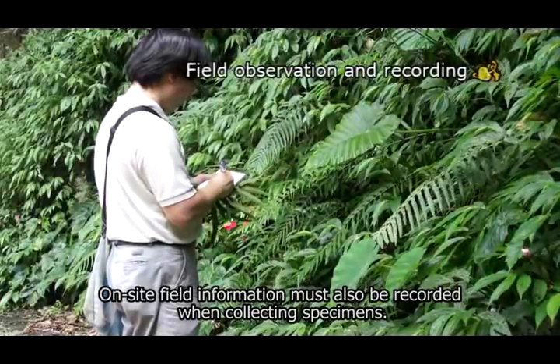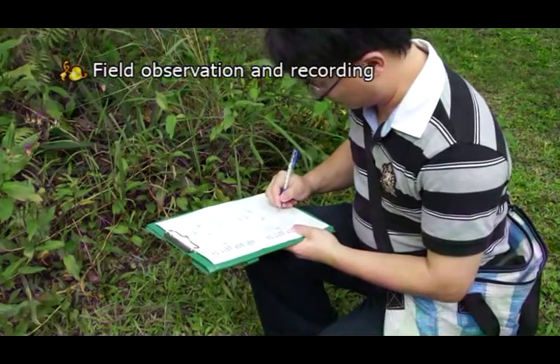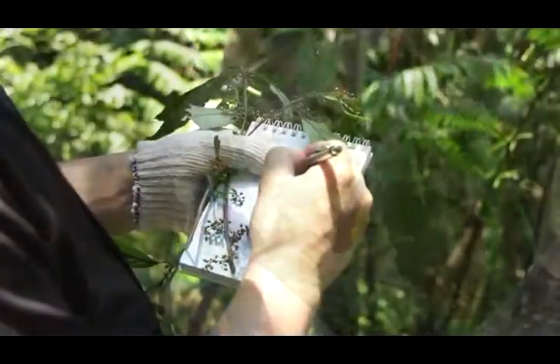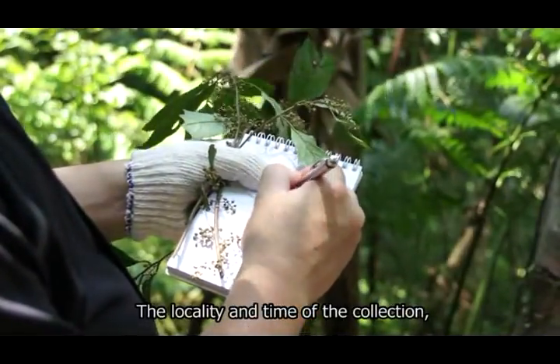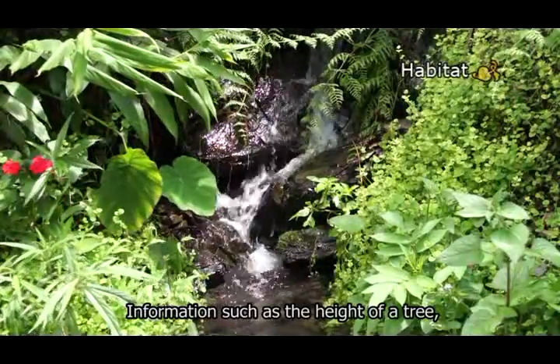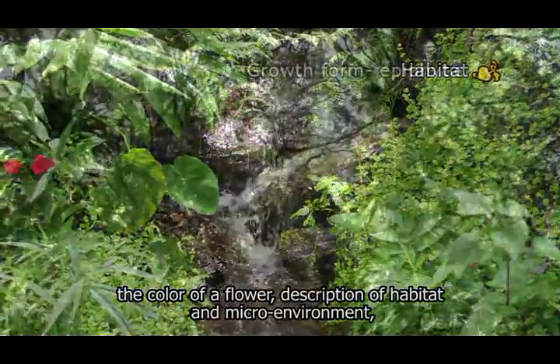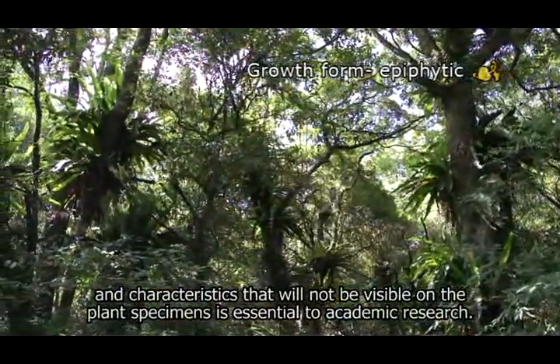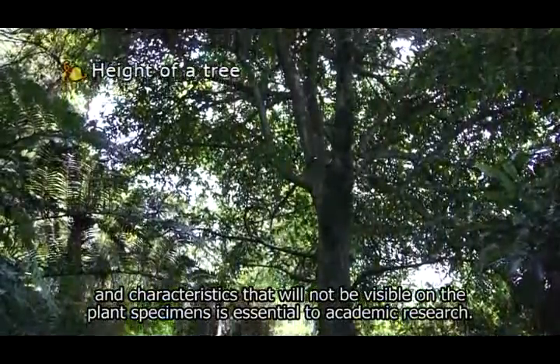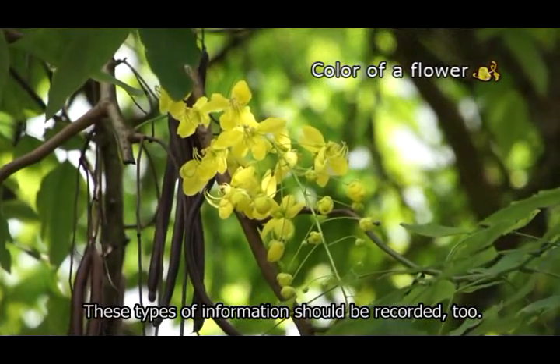On-site field information must also be recorded when collecting specimens. Each specimen must be numbered by the collector with its own collection number. The locality and time of the collection, as well as the name of the collector, should also be recorded. Information such as the height of a tree, the color of a flower, description of habitat and microenvironment, and characteristics that will not be visible on the plant specimens, is essential to academic research and should be recorded too.